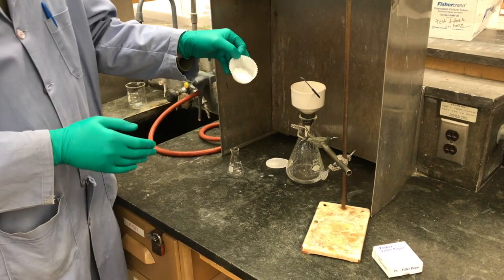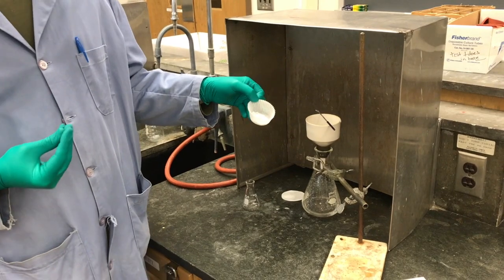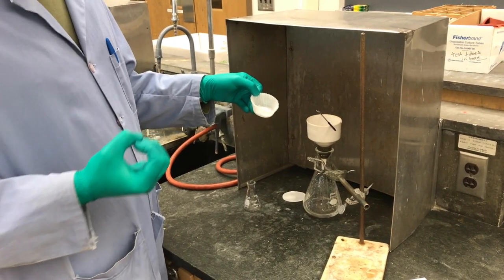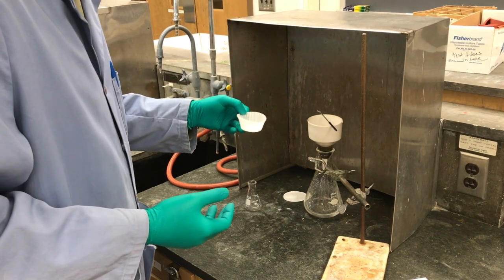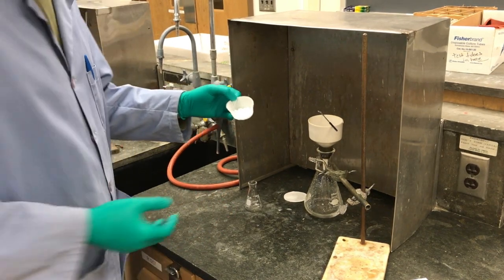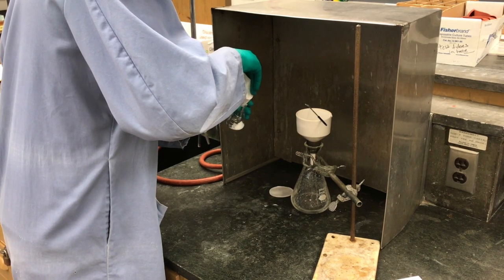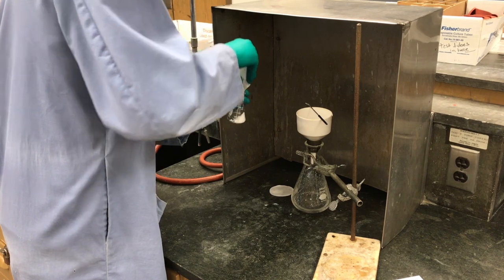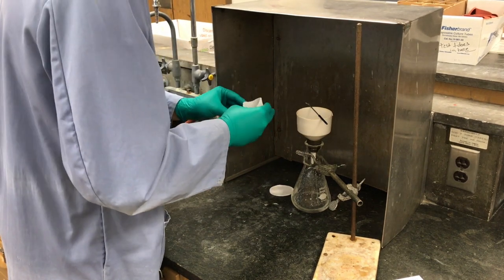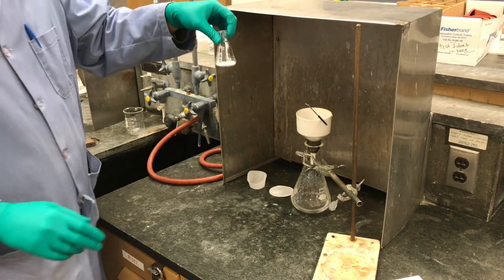So we have a nice white crystalline solid, and there's definitely a vinegary smell to it. So we know in this reaction we'll be creating acetic acid, which is just vinegar. So that smell is probably from a little side product. So I now have a good amount of product in an Erlenmeyer.